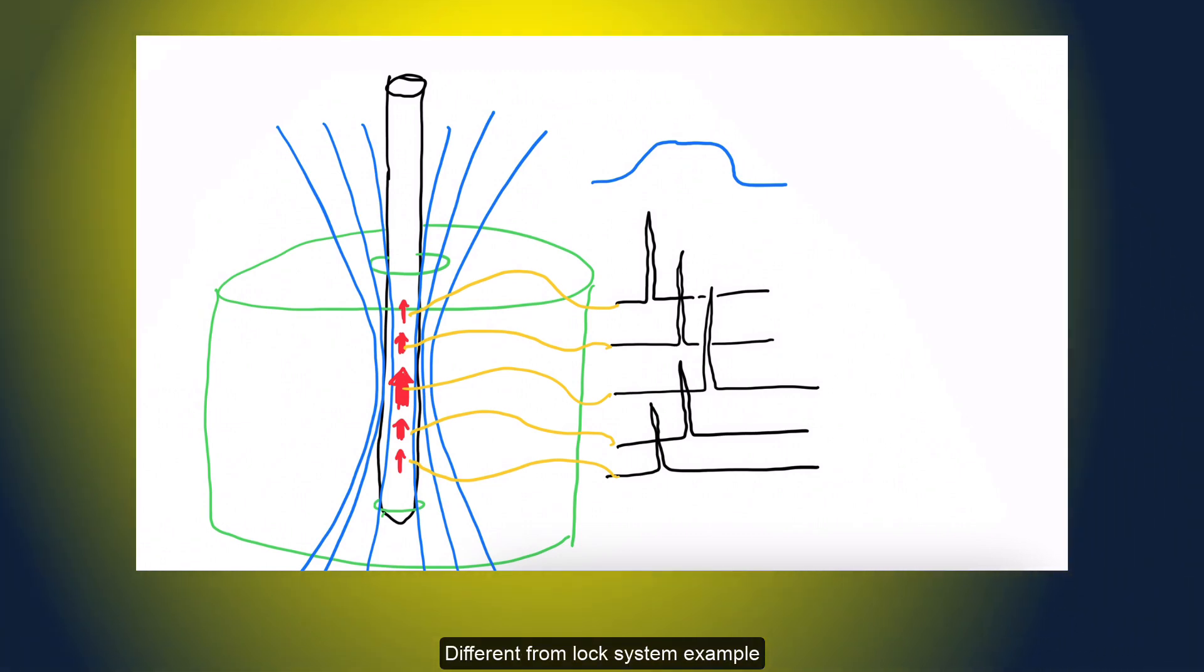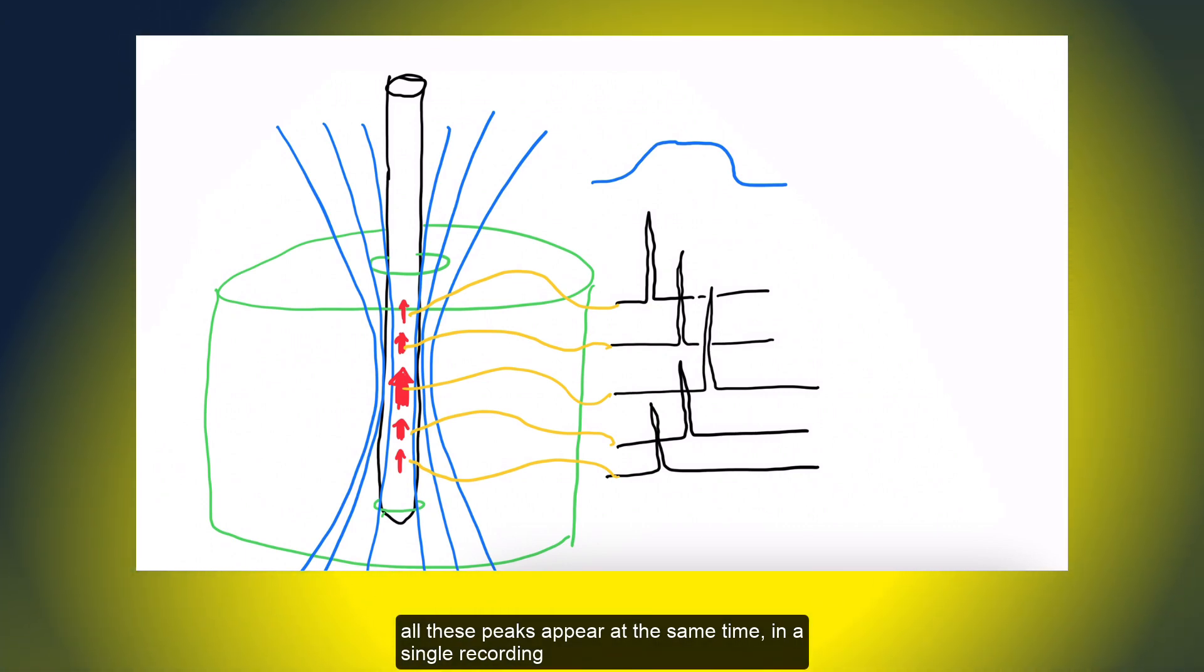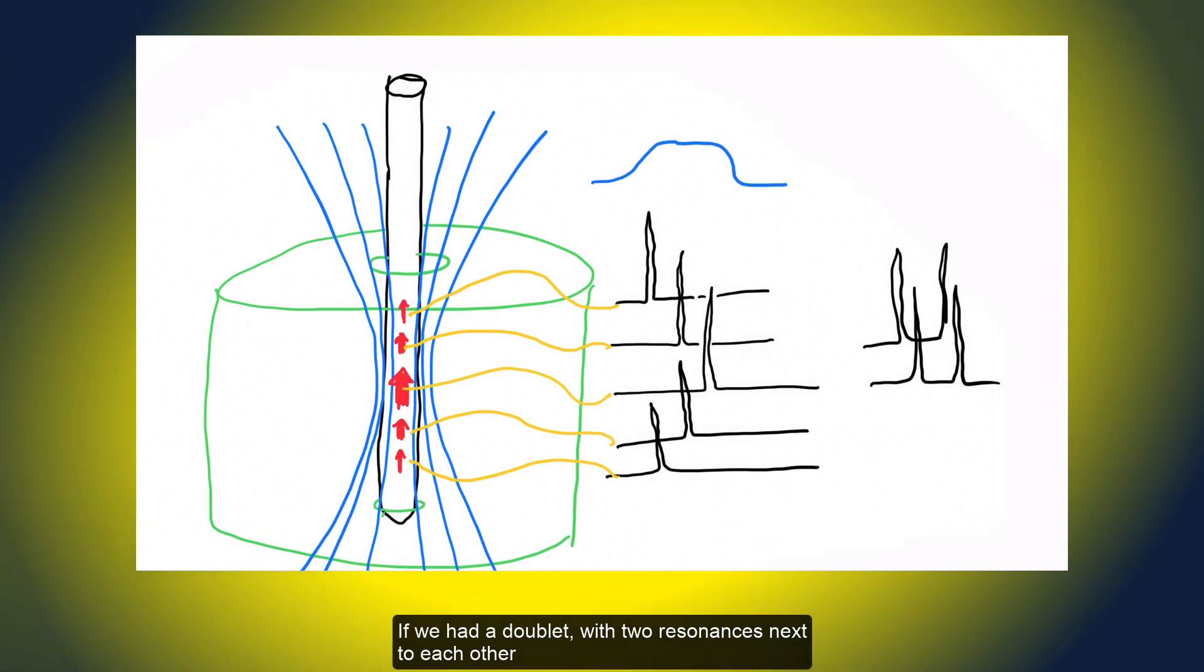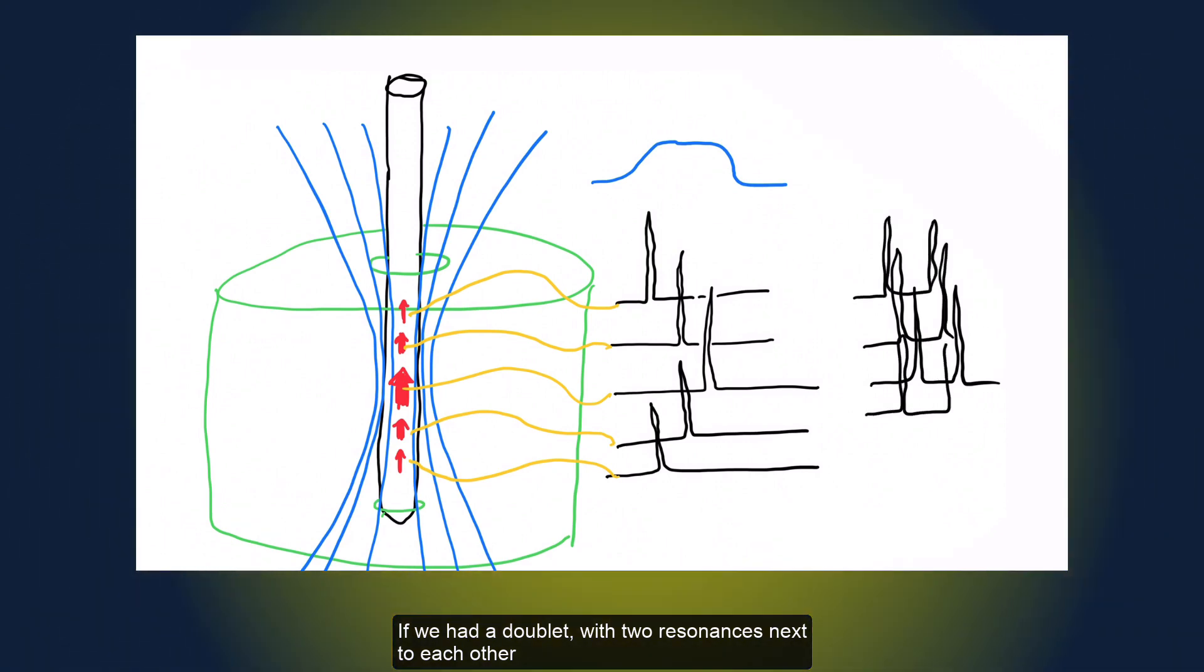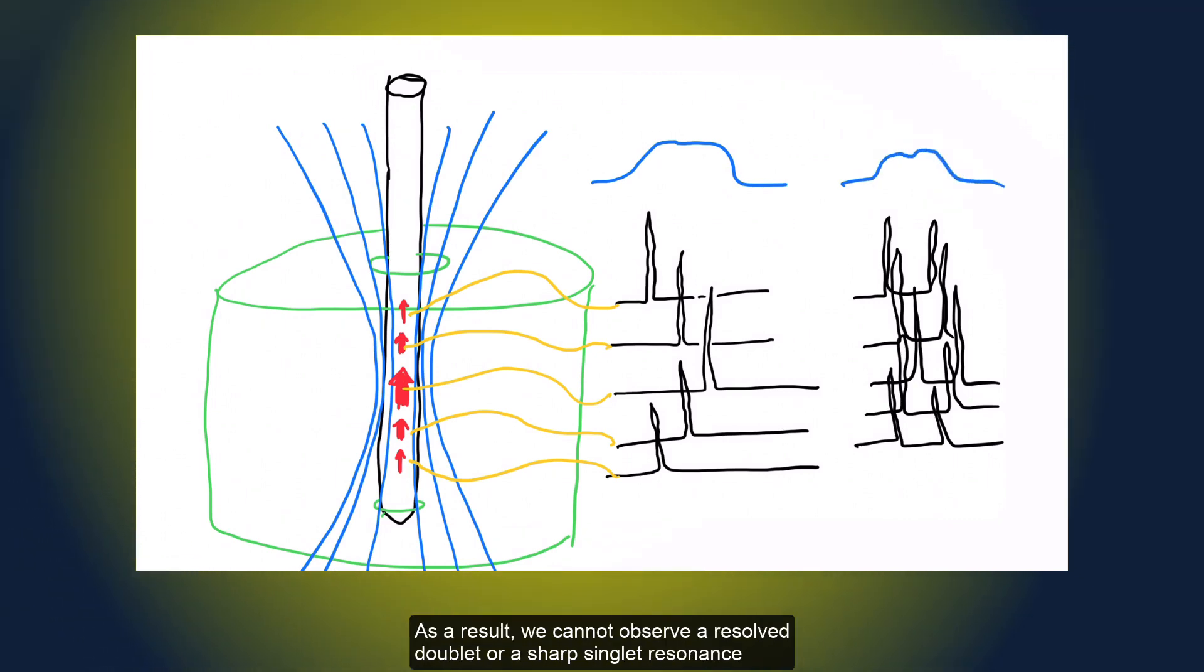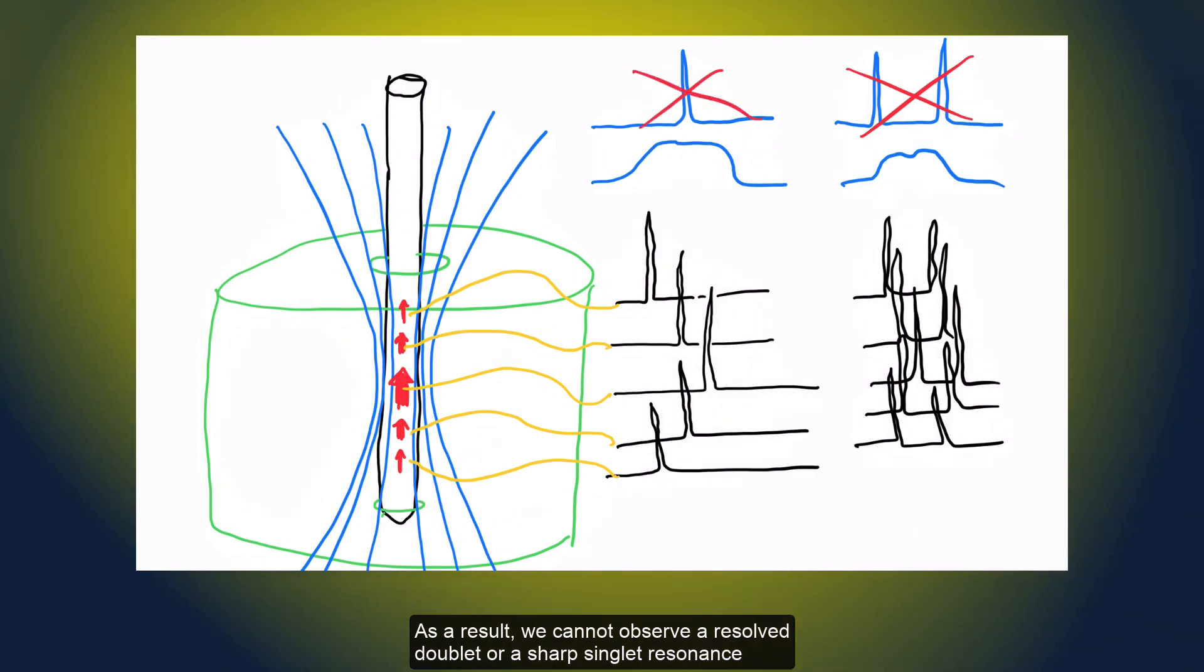Different from the lock system example, all these peaks appear at the same time in a single recording. If we had a doublet with two resonances next to each other, such divergence of magnetic field would lead to poor resolution. As a result, we cannot observe a resolved doublet or a sharp singlet resonance.